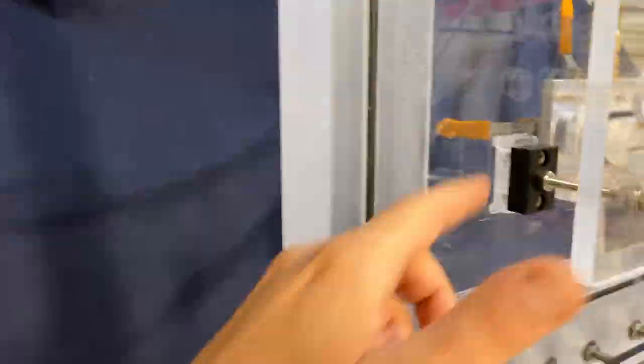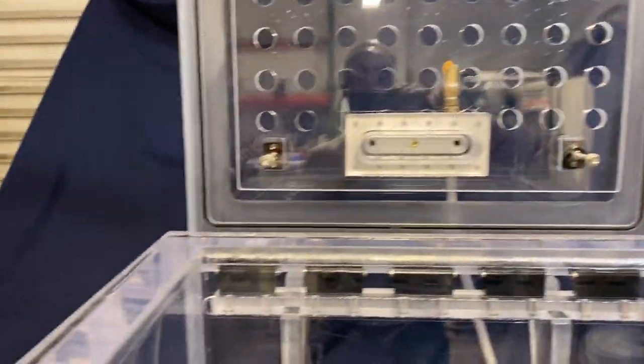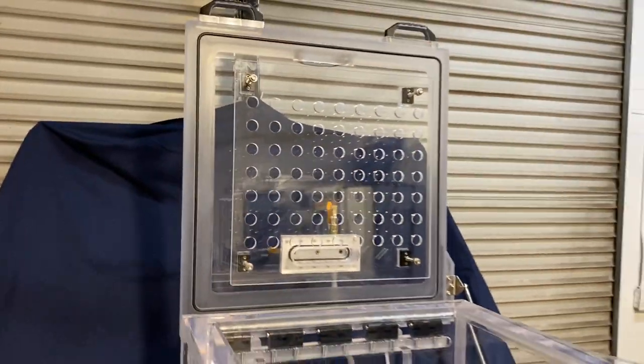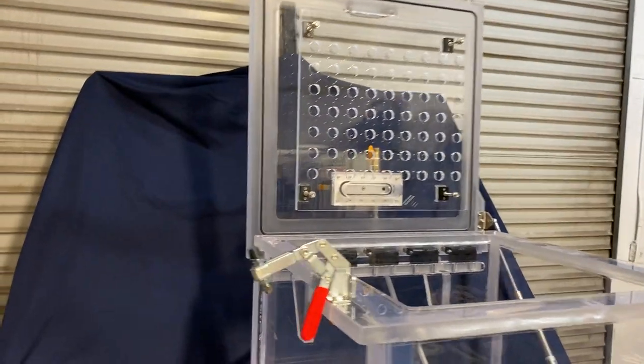And then you'll notice that this package restraining mesh is connected through these four legs and essentially these four legs are adjustable, they're removable so if you ever need to remove them you can do so.